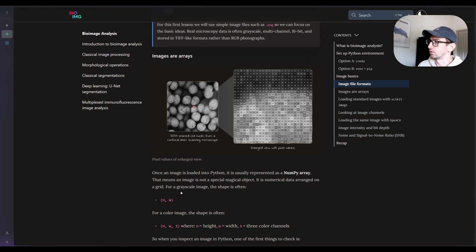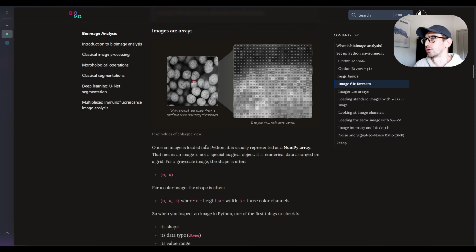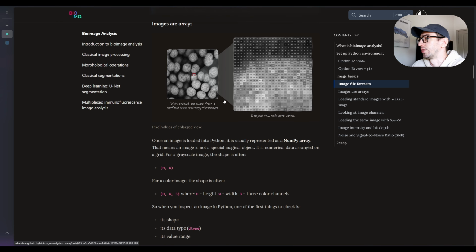Then you can project it to the data, take a look, and you will see that you converted the original image into the binary format where you have only 0 and 1s, and then you have the representation of which areas of your image are higher than the average. So this is a representation of a grayscale image where you have black and white.